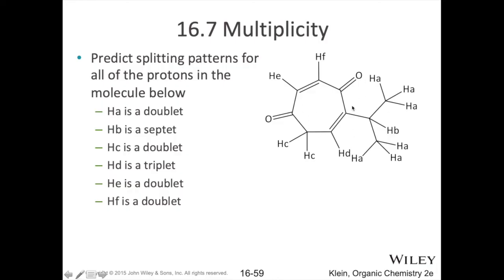All right. That being said, now that you've identified which of your hydrogens are equivalent, that's a very important first step. Once you do that, then you can start looking at which hydrogens are within 3 bonds of each other. So for example, if we look at hydrogens A and B, if we just pick any one of your hydrogens A, 1, 2, 3 bonds to hydrogen B, and likewise hydrogen B is within 3 bonds of any of these hydrogen A's.